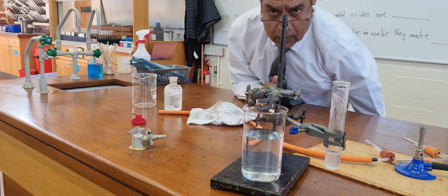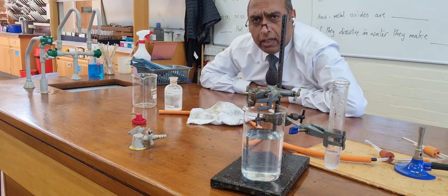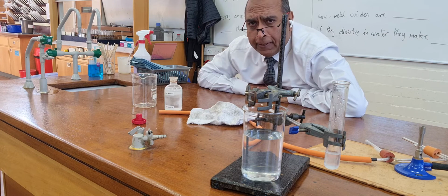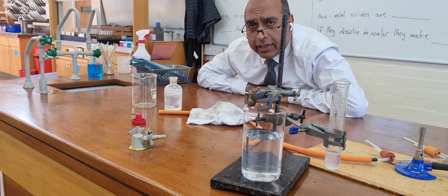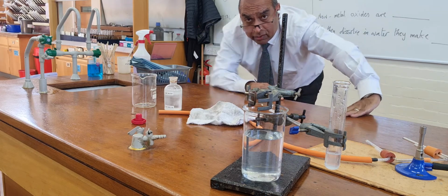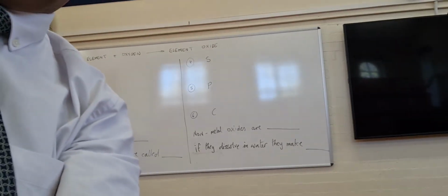So, what am I hoping that you learn from that? I'm hoping you learn that when we have compounds, the compounds will burn, and the elements within the compound make the elemental oxides that are present within the compound. Now, last lesson, I burnt the elements on their own. And I just want to go through some equations with you. I hope you can see that. Equations there.